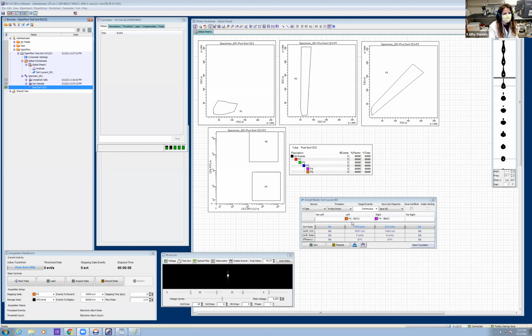So what I did here, thanks Derek, is I went ahead and created a new tube and ran a quick cleaning of the instrument. Because what I want to make sure is that when we go to run our post-sort purity check, there's nothing remaining in the lines, okay? So that we can be confident in those post-sort purity results.